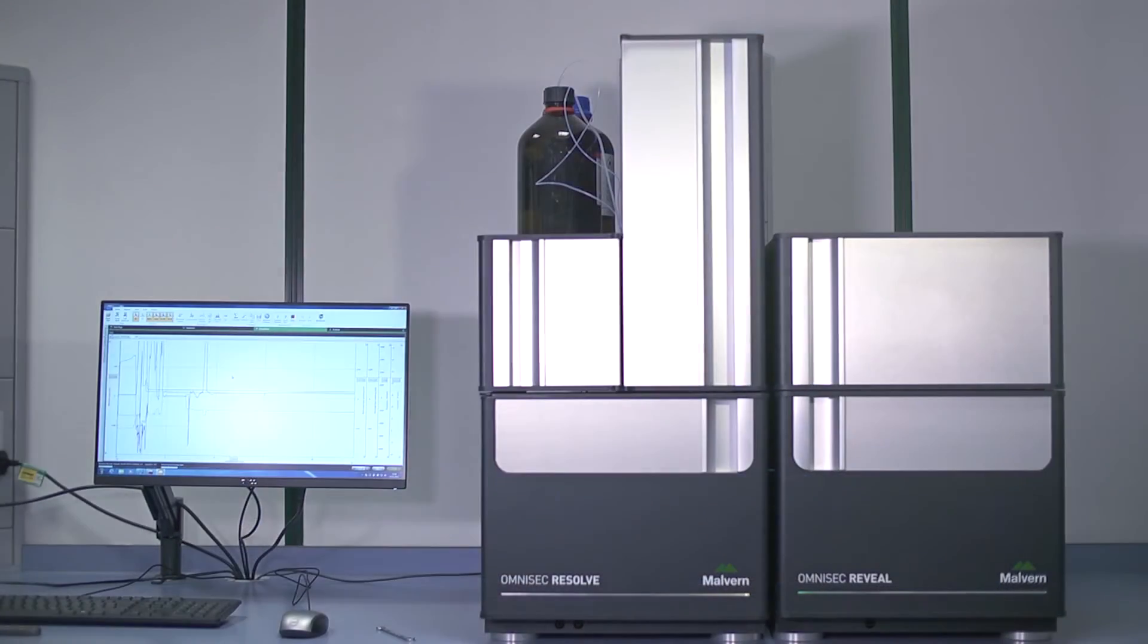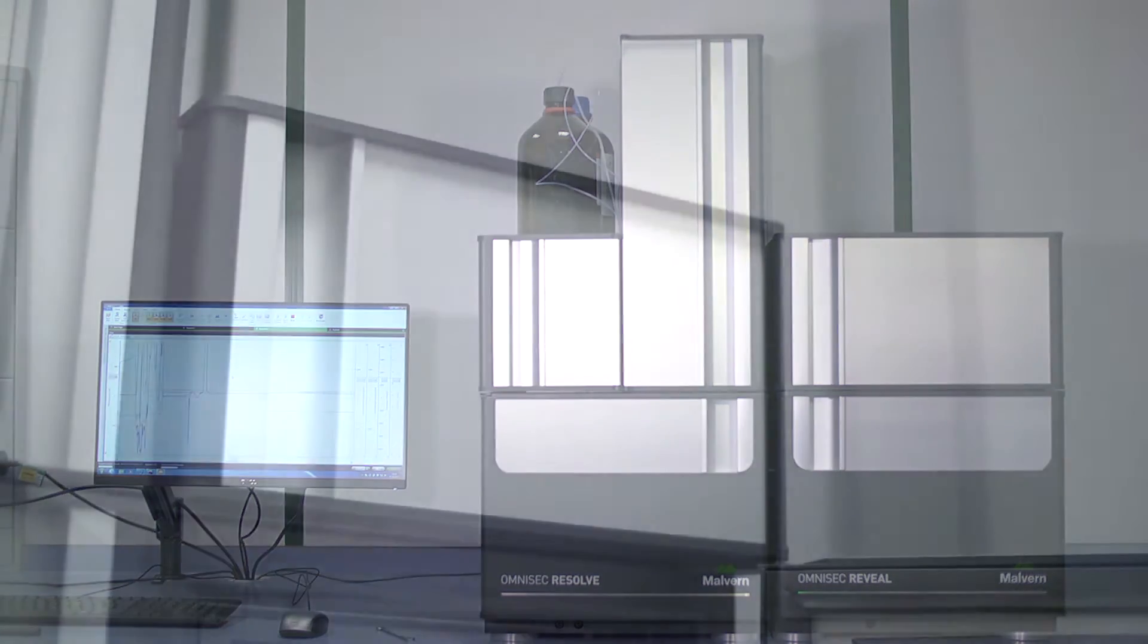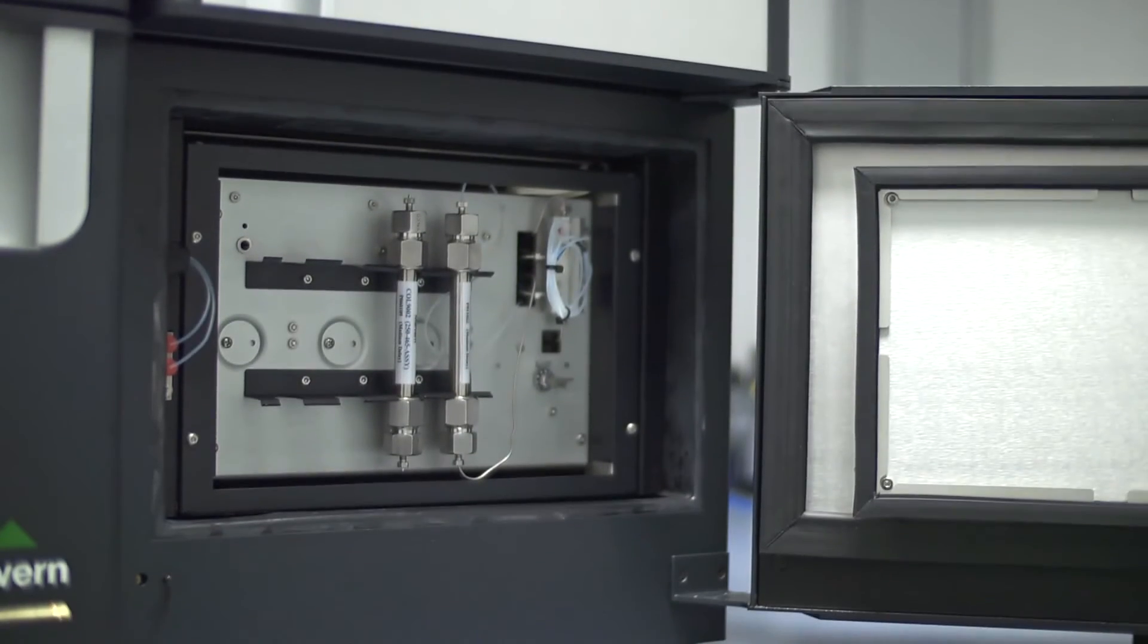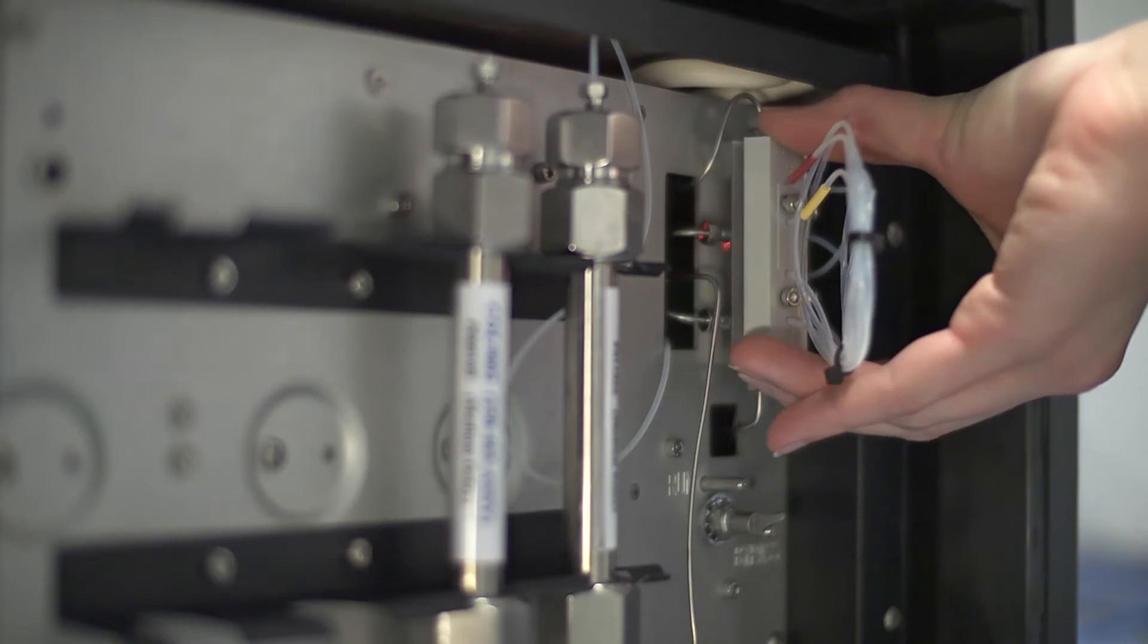Inside Omnisec is the world's most accurate and sensitive light scattering detector and a completely new design of viscometer.